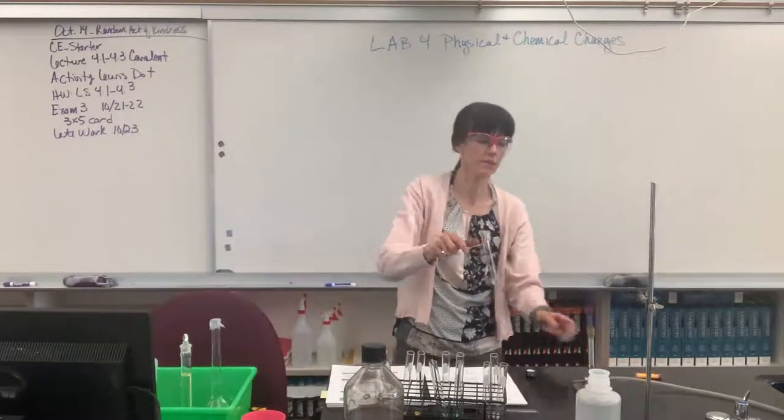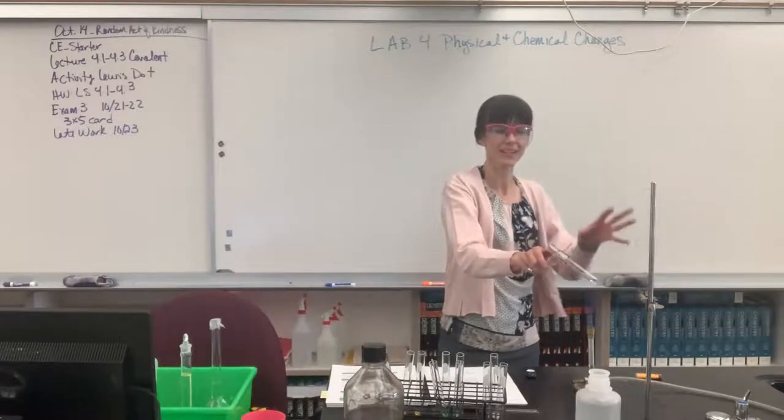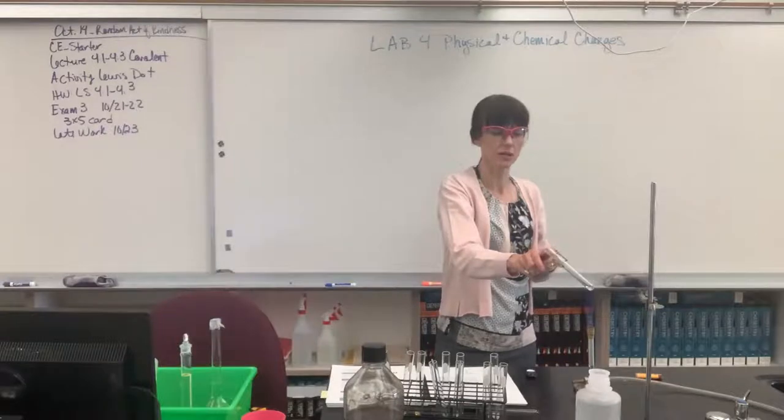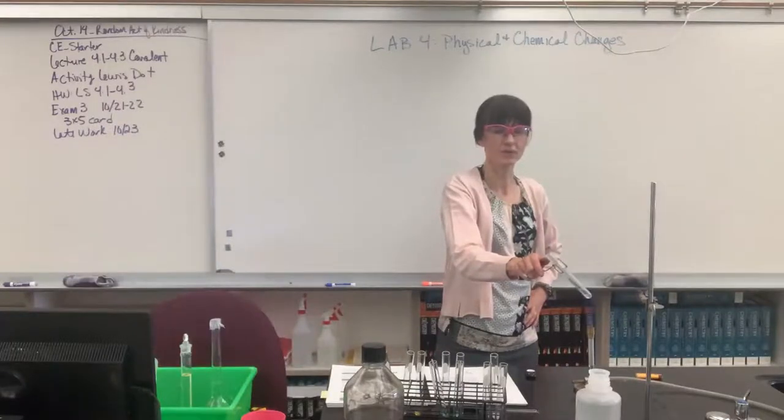Okay, good, you can see the flame. I'm going to put the flame at an angle, and I can start to see some condensation on this. And we have to wait for that to evaporate. It's starting to boil. It's heating up pretty fast. Very cool. You can probably see the steam coming out of it.